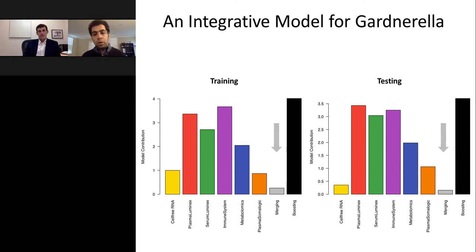So it's important to not make general statements about one platform being better than another. It's just that one platform may be more relevant for one specific biological task. When we combine the data sets, again, the model that accounted for both modularity and size did a lot better than simply accounting for size without accounting for modularity.